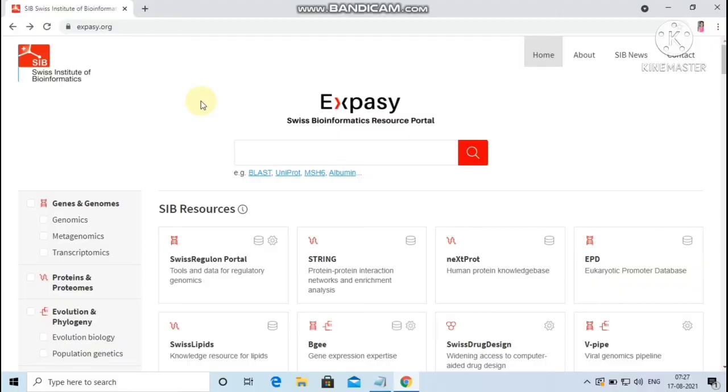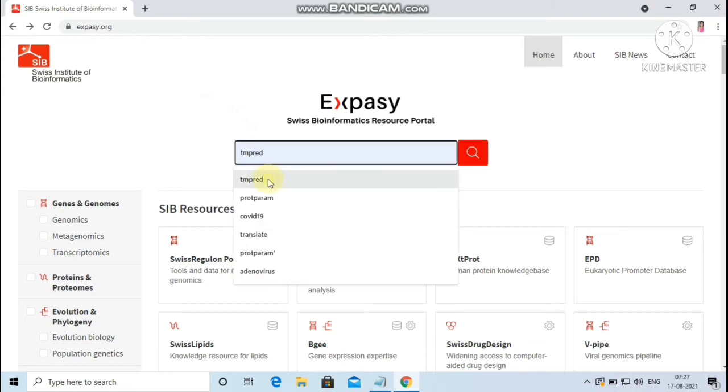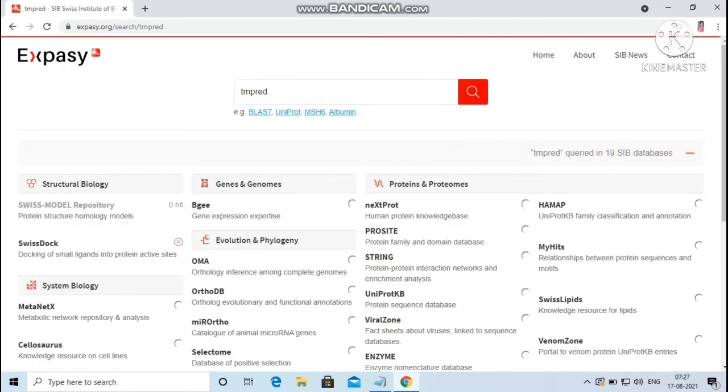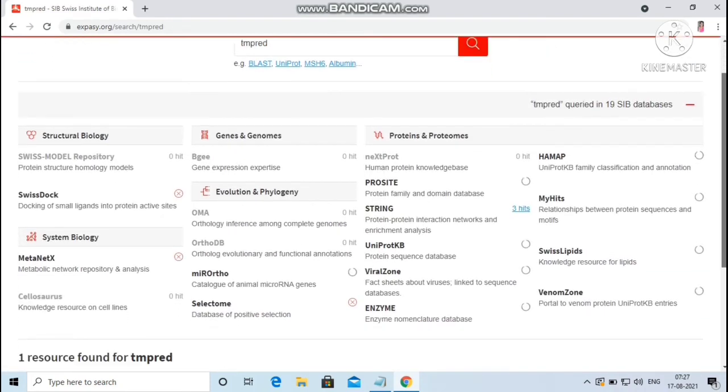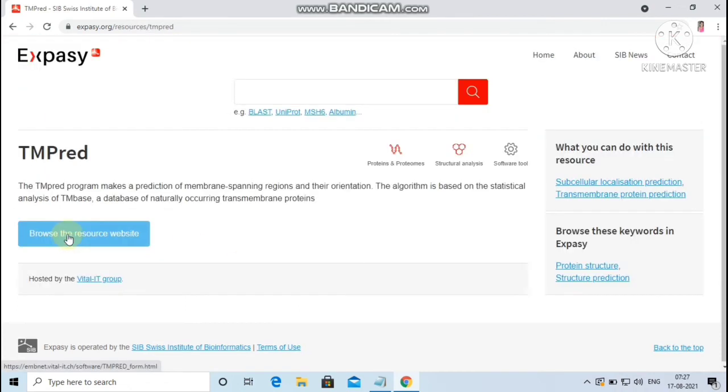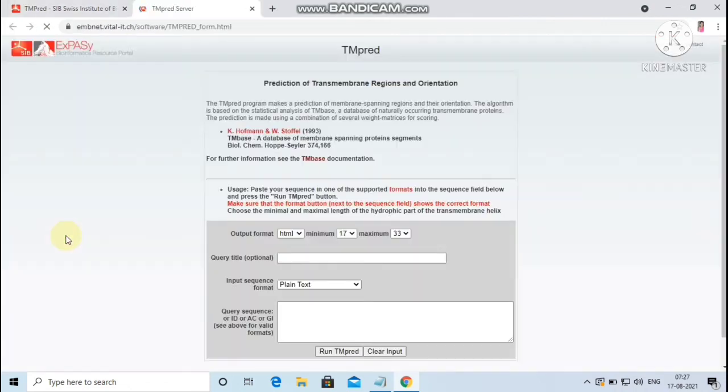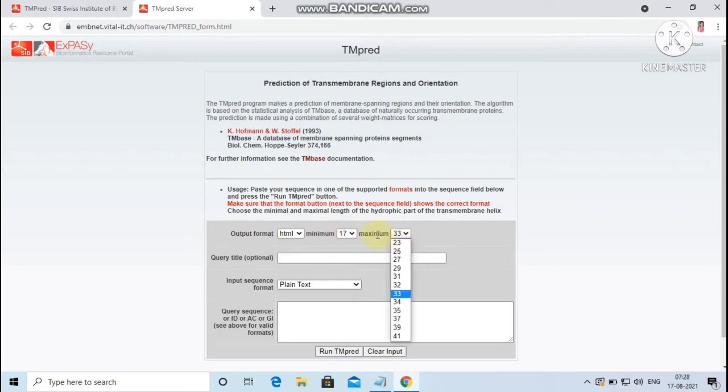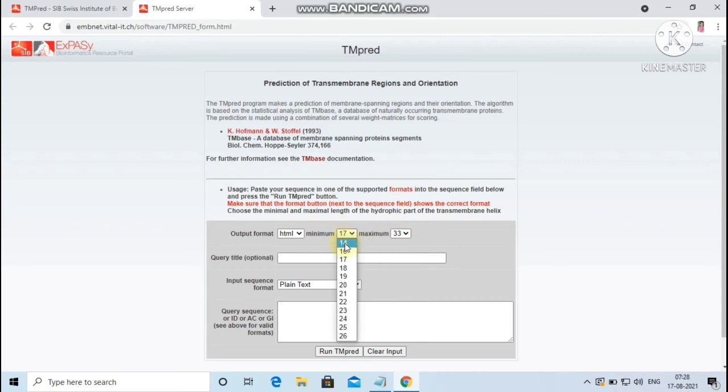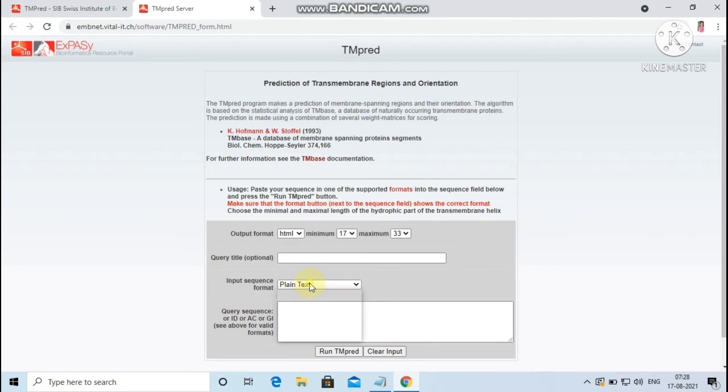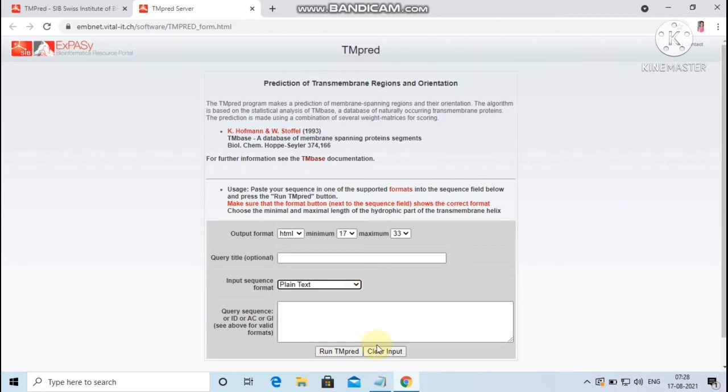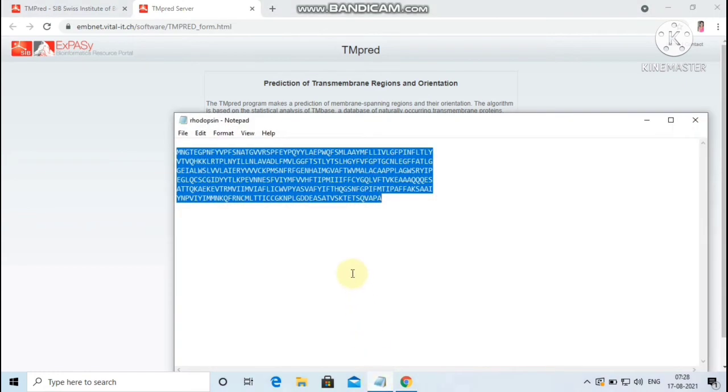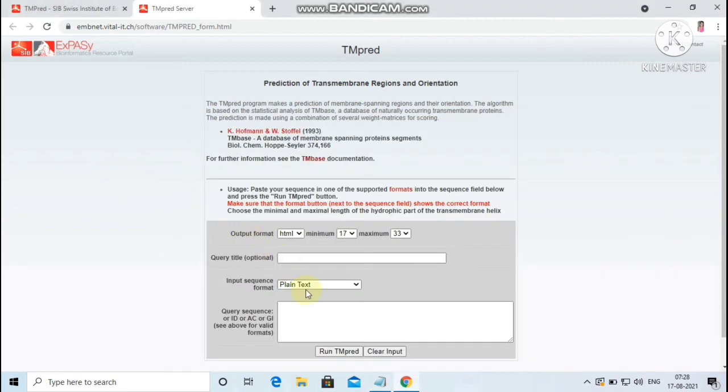Let me give demo on the TMpred server. As I said before, it can be accessed by using the keyword TMpred in resource portal ExPASy, or it can be directly accessed through your web browser. The default output format of the TMpred server will be HTML. You can choose the minimal and maximum length of the hydrophobic part of the transmembrane helix for which you have to make predictions. Here the minimum number of length will be 14 and maximum length will be 41. You can give the title of the query. There are six input sequence formats including the SwissProt and TrEMBL ID. I have chosen the plain text format. Here I am going to predict the transmembrane helix of the protein rhodopsin of human.